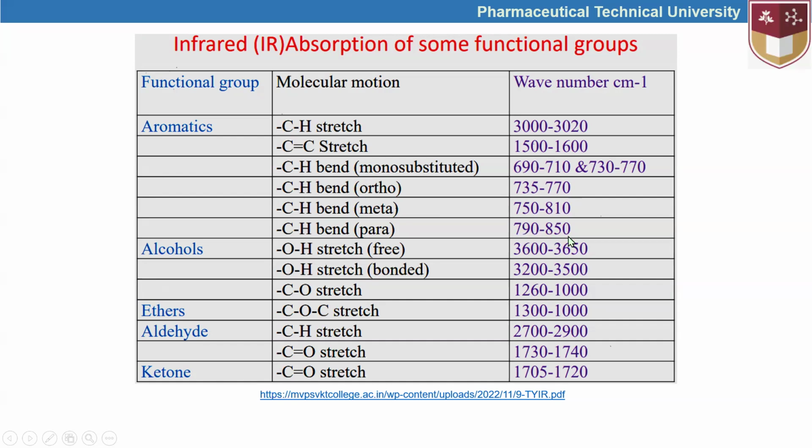So there are differences based on the location of derivatives as well. We are going to give some exact results in the next pages. So what we have to understand from these results is that not only the number of substitutions, but also the positions of substituted functional groups can affect the wave number and the absorption of the functional groups.